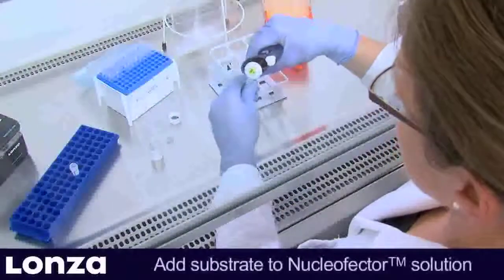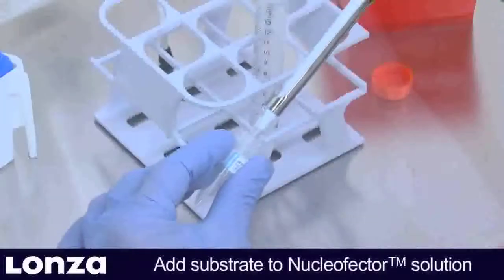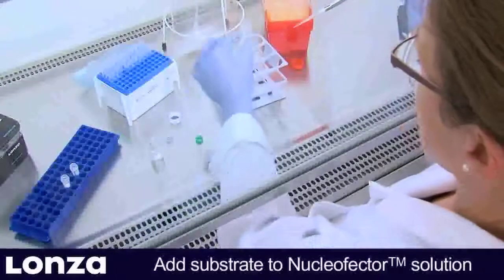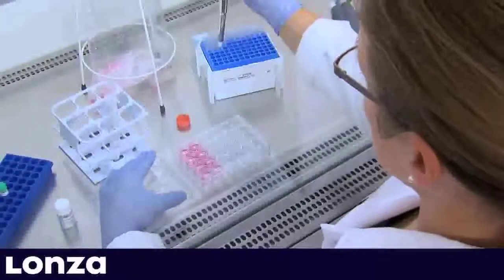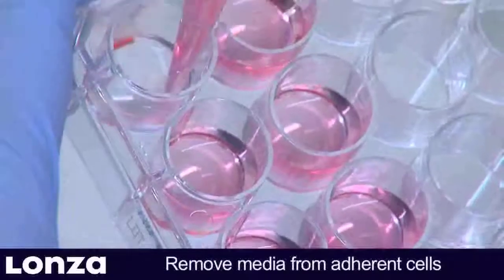Then mix the required amount of Pmax GFP vector or substrate of choice with 350 µL Nucleaffector solution per sample. Now prepare the cells. While removing media from the adherent cells, be careful to avoid disturbing the monolayer.